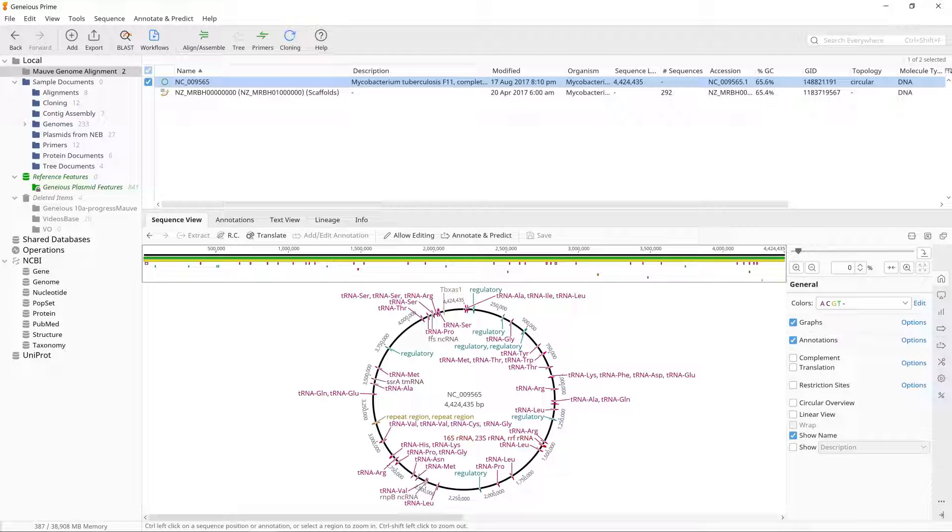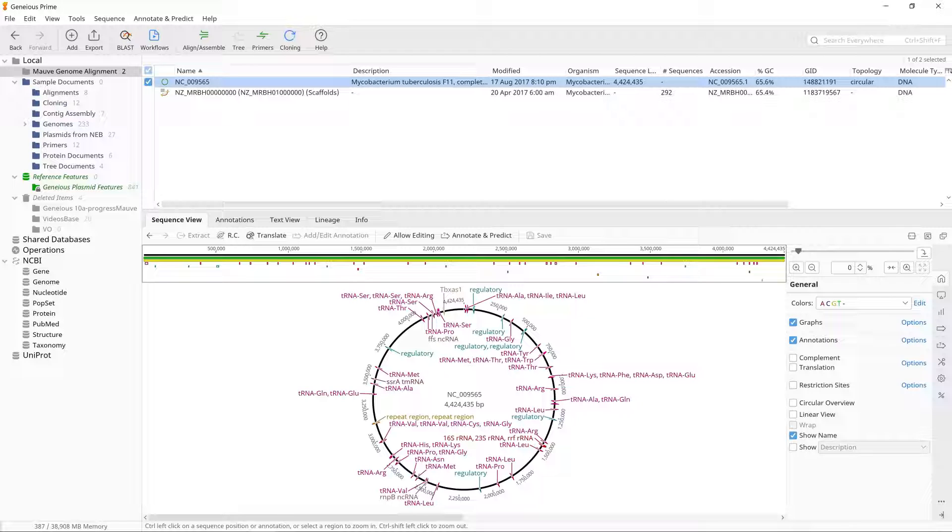The reference genome will be automatically determined if one of the two files selected is a single sequence, as in this example. If both files are a sequence list, you will need to choose the reference genome from the drop-down list.